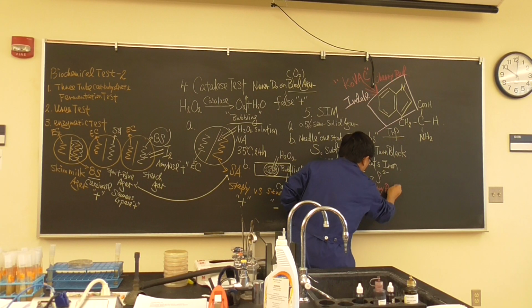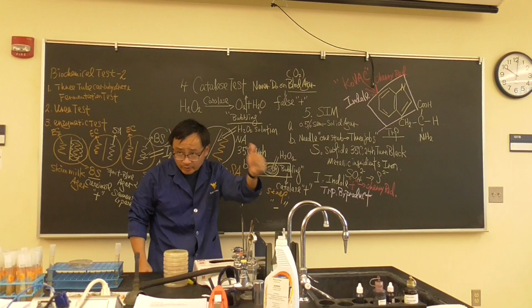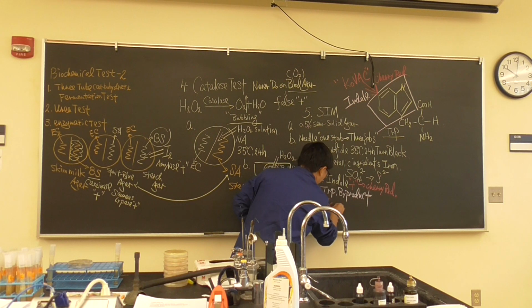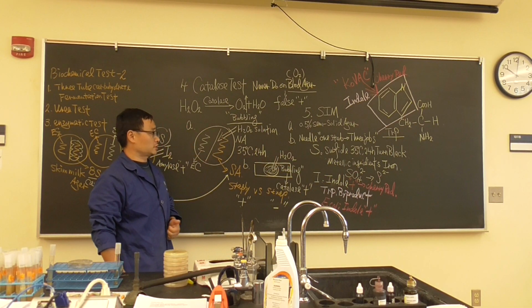And I tell you, the indole test is very important. There is one bacterium everybody knows is indole positive: E. coli. E. coli, indole positive. Okay, so that's very interesting stuff.